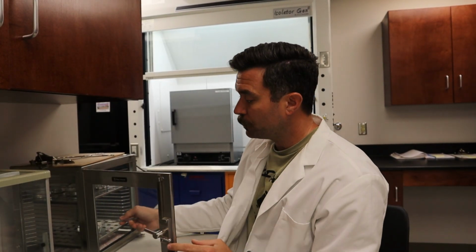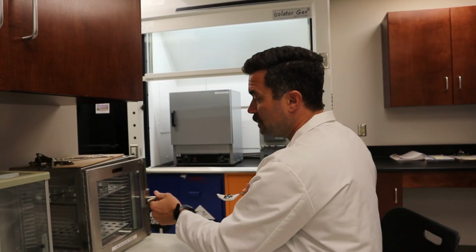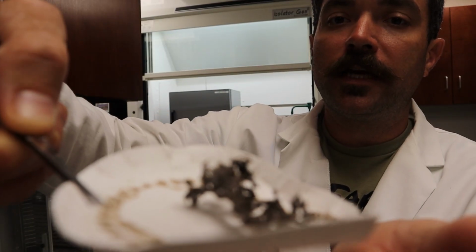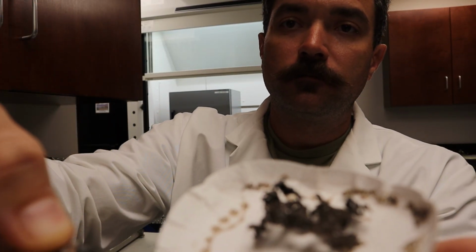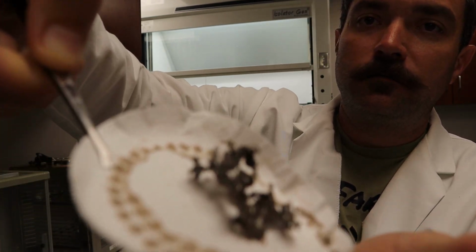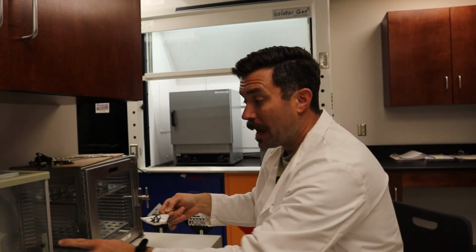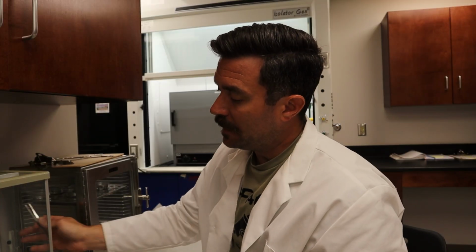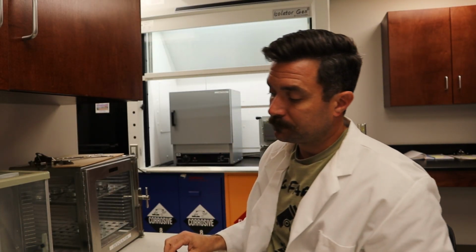So here we are. It's been 15 minutes. We've let it cool in that moisture-free environment. And let's take a close-up look before we actually put it on the scale. Do my best here. It looks like old crusty potato chip, old poop chip. You want to check out the poop chip? Take you a bite. Don't eat it, that'd be gross. That's our dried sample from our mixed liquor. So we are going to set that in our analytical balance.